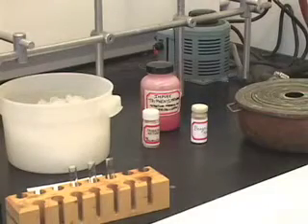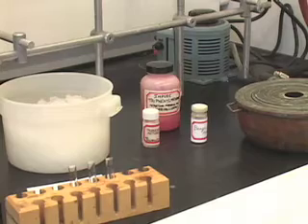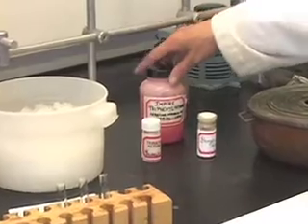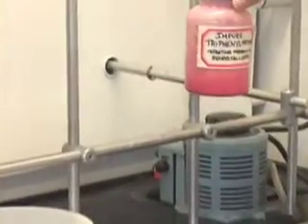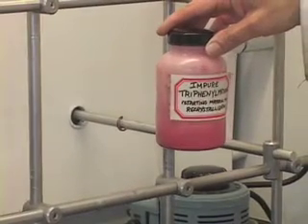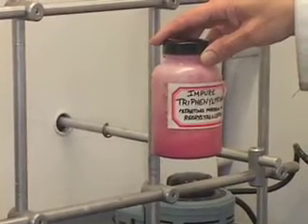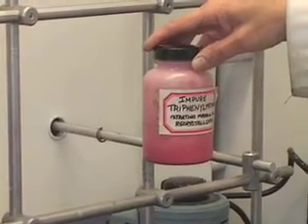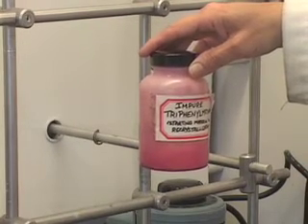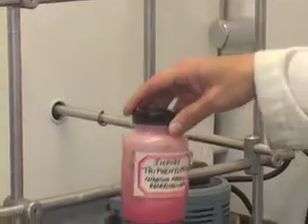Today's experiment is recrystallization. We use recrystallization to purify an impure solid. What we are going to use as our compound today is triphenylmethane. This triphenylmethane obviously is impure. It contains soluble impurities, insoluble impurities as well as colored impurities. So, we will try to purify this impure triphenylmethane by recrystallization method.